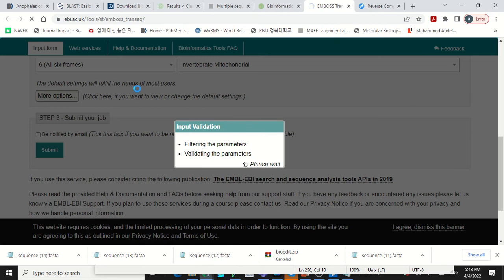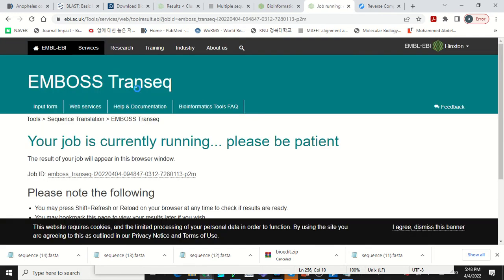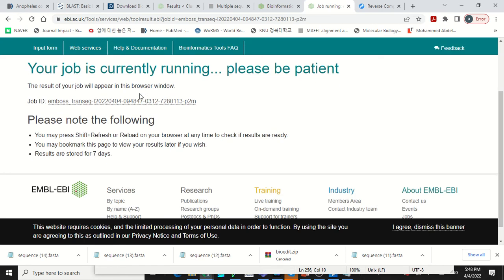This will give us the different reading frames, and it will show us the one to which our sequence belongs, because we know this sequence already. We know it's CO2 already, so we have pre-informed knowledge. But if you don't know which reading frame, or you are just having the sequence for the first time, you can just select all 6 frames for you to have a wide view.